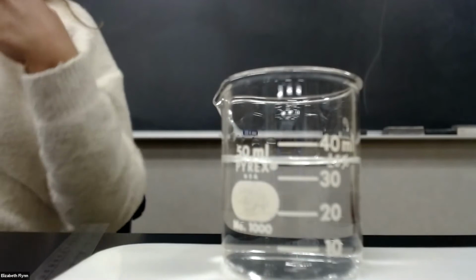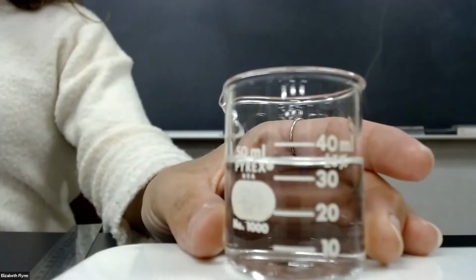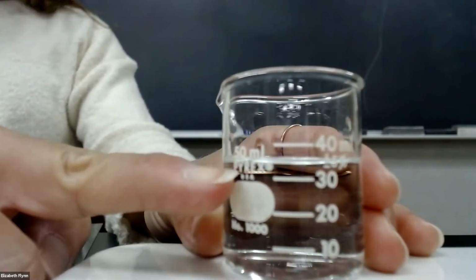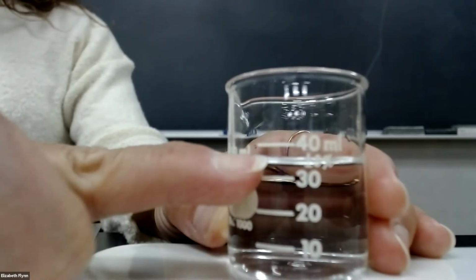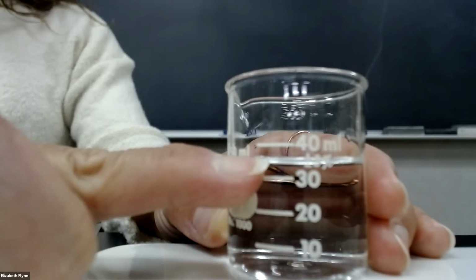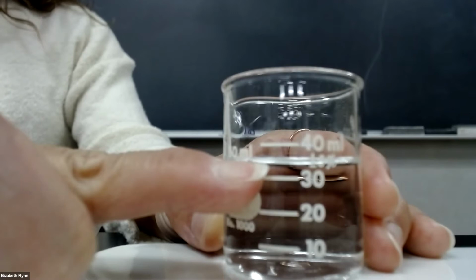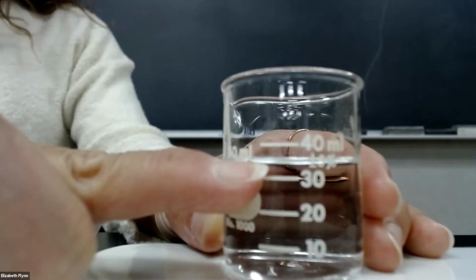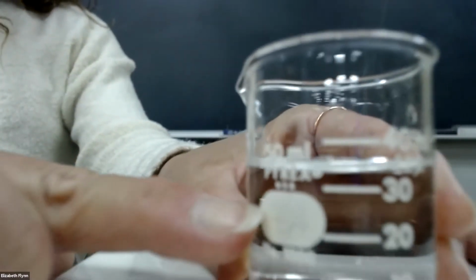But the important part of the water that we're measuring is, is it the top of the meniscus or the bottom of the meniscus? Are we measuring here or here? Bottom or top? Right, it's the bottom. We're always measuring the bottom of the meniscus when we're measuring a liquid, specifically water, in a measuring device. Let's see if we can get that sharper.